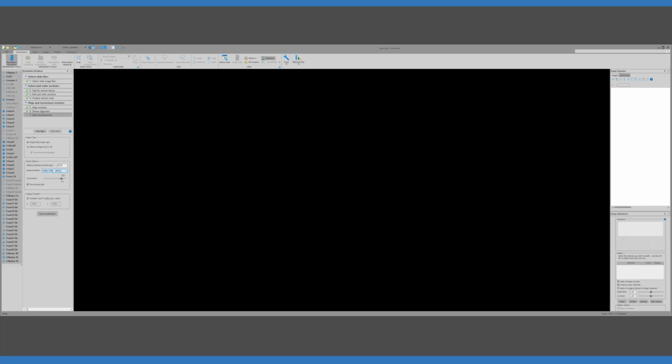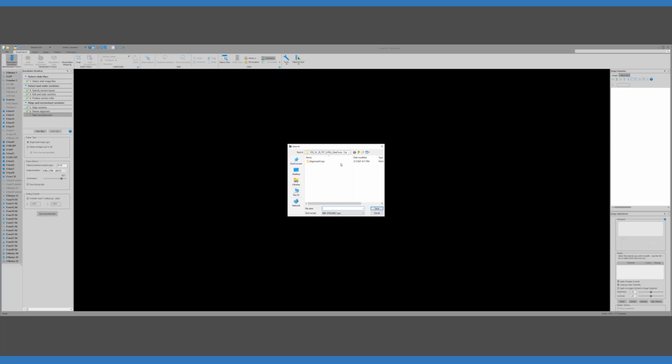It's often good to first save a downsampled version. So in this case, a 25% version, just as a check. It's quick to generate, and then you can take a look and see if the whole structure that was reconstructed looks good, and then you can go and see the full resolution version. So I'm going to save that. I'm saving this at a low resolution so that it runs faster, so we can just see, for the purposes of demonstration, how that works. I'm going to just do a 25% resolution and then save that.